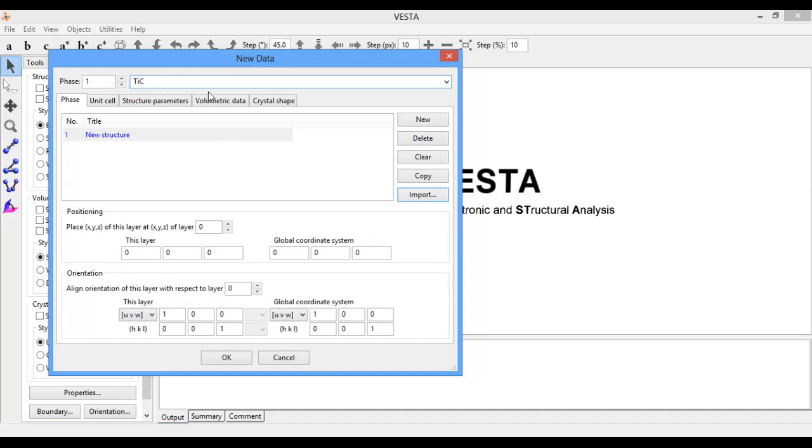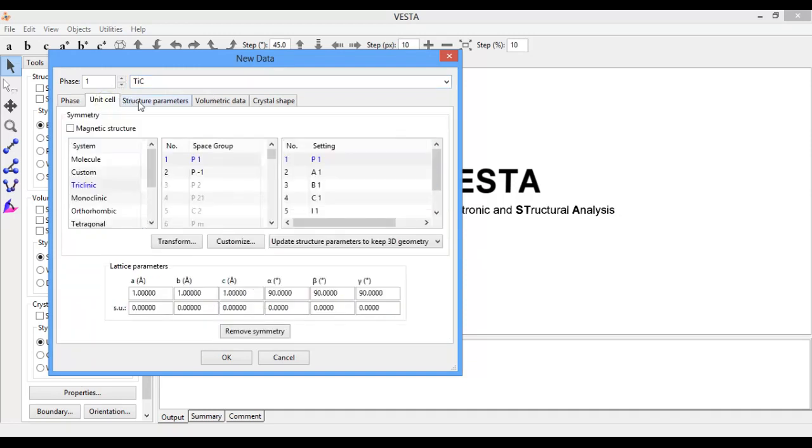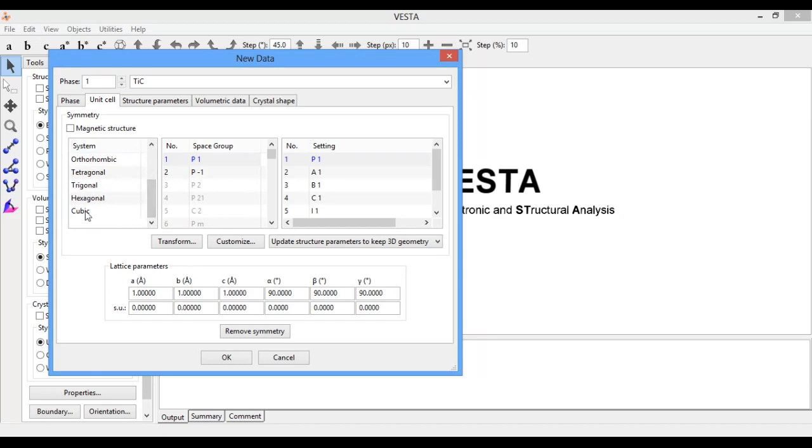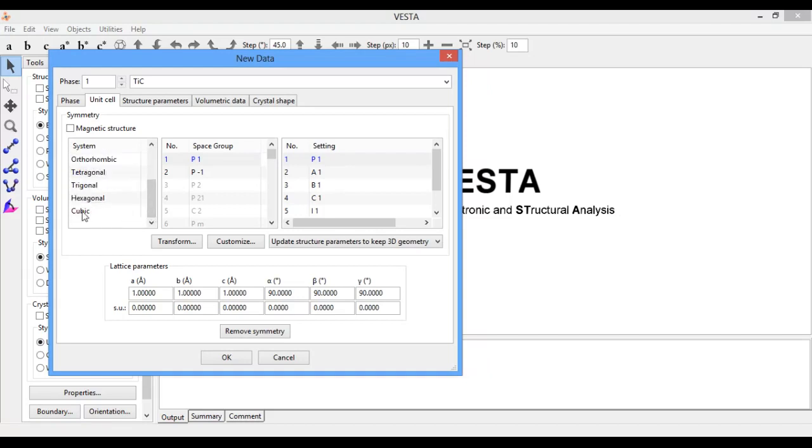You need to know about the space group, which is related to every structure. Titanium carbide has a cubic crystal structure, so I will select the cubic form.